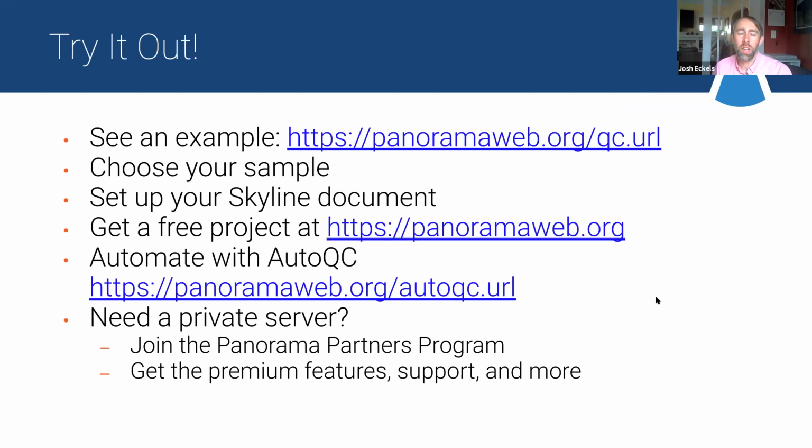Yeah. So I think this is the screen that I didn't show in my screenshots here in the deck, but for setting one of those up, yeah, you do right now need to know the date time format that the server is expecting, and I'd love to make that more of a calendar control or something like that. It's definitely great to hear from people that they are using those annotations. That's definitely a +1 to prioritize that, because I was always worried that it sounded like a good idea, but that people didn't use it as much in practice. So thanks for that feedback.